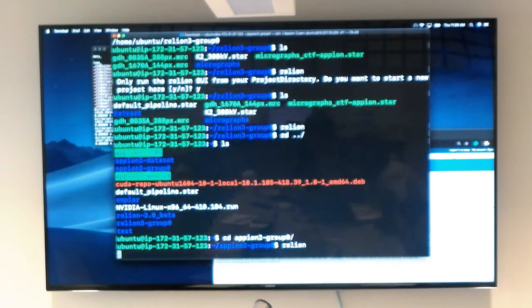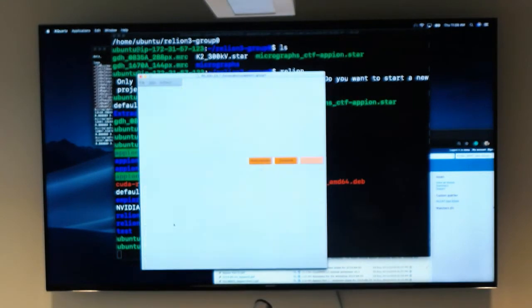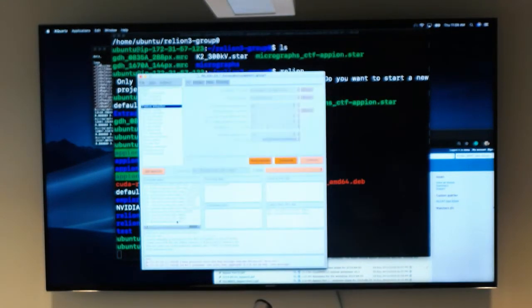If you type in Relion in there, you'll know that many steps have been pre-run. So if you don't want to do particle extraction and you want to just start from there, you can go there. You just have to make note that you're going to start at job 15 moving forward. Or if, let's say, you're running out of time, you can just say, I just want to see 3D refinement, and you can just jump into that.